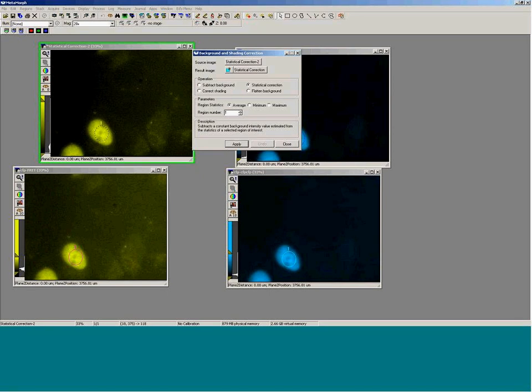Turn off auto scale and scale this up so you can definitely see the fact that FRET efficiency is typically anywhere from 20 to 40%, which is very high FRET efficiency.